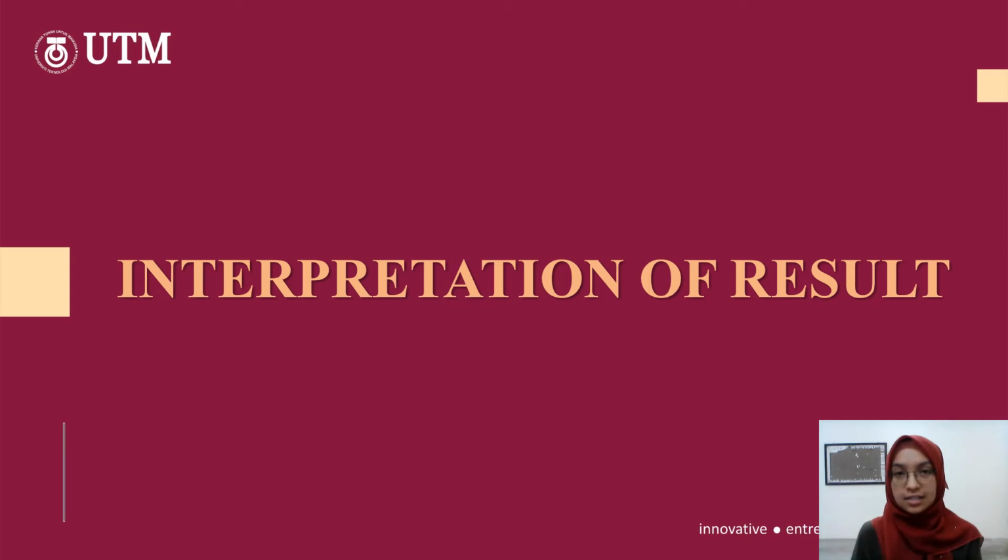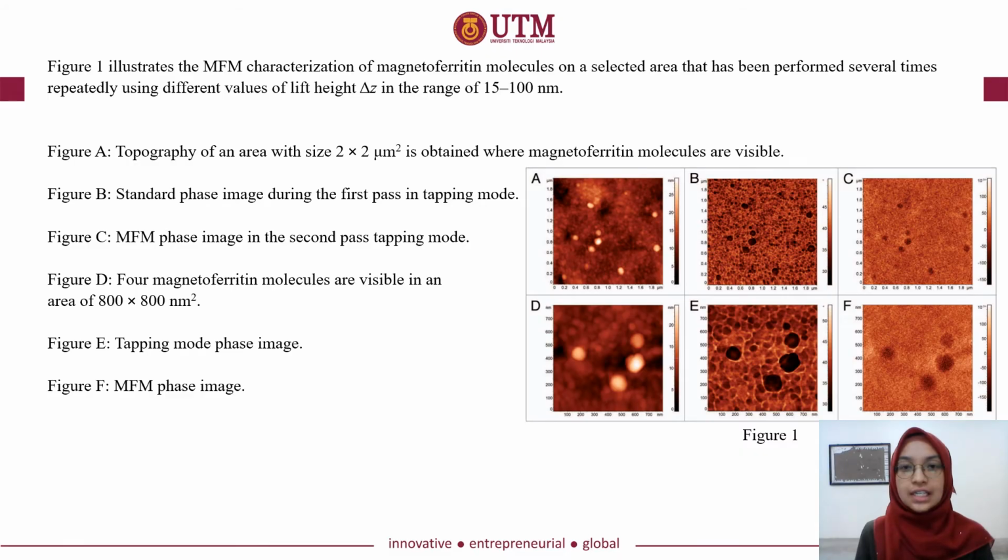After the analysis, now we will look at the interpretation of the result. In this slide, Figure 1 illustrates the MFM characterization of magnetoferritin molecules on a selected area that has been performed several times repeatedly. We use different values of lift height in the range of 15 until 100 nanometer.